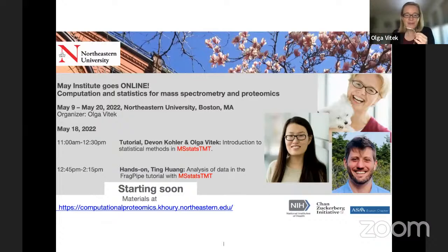Then I will speak about the statistical methods specifically implemented in MSstatsTMT, which is one of the packages in the MSstats ecosystem. If you're joining us for the first time, my name is Olga Vitek. I'm a faculty in the Khoury College of Computer Sciences at Northeastern, and our lab is the main developer of MSstats. And let me right away introduce Ting Huang, who will then do some hands-on analysis talking about how we actually work with TMT-labeled experiments.